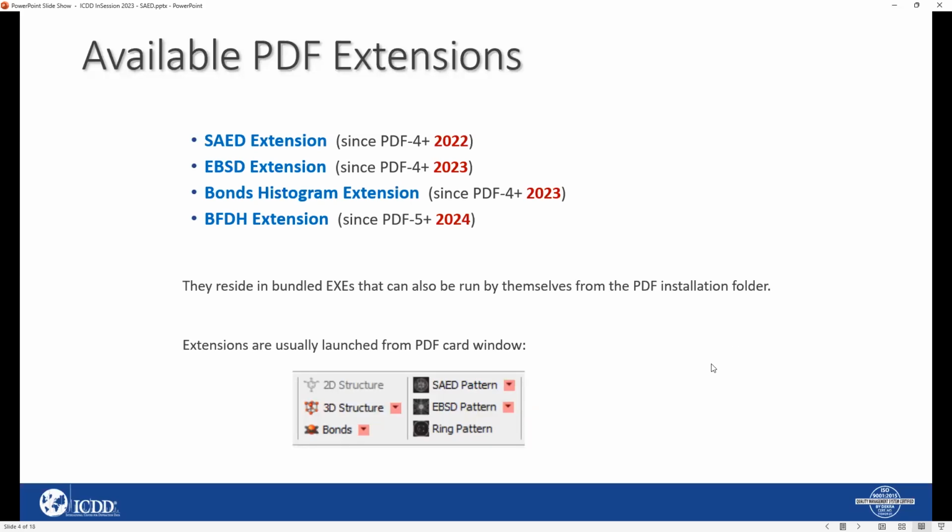And just as a side note, the development of these extensions is strongly affected by user feedback. So far, we had not much or no user feedback. So if you want to see some features included in the future, please contact us with sample files, sample images, and a wish list of features that you would like to see.